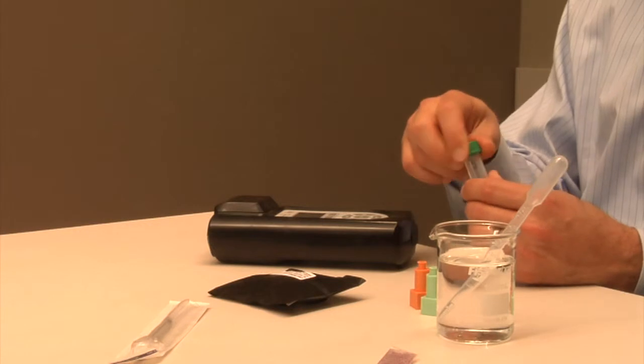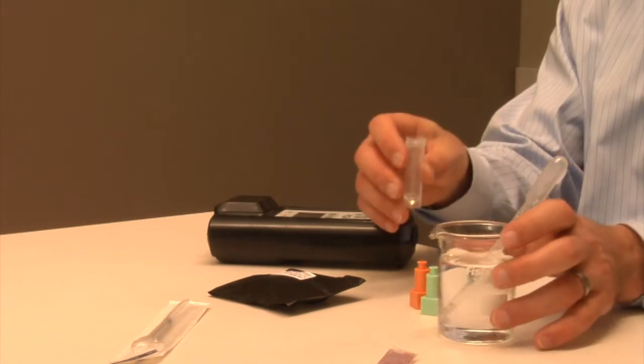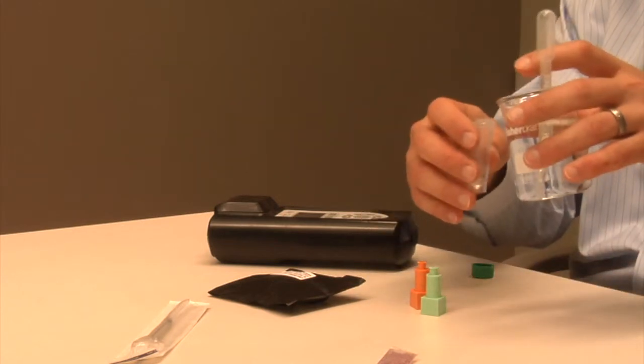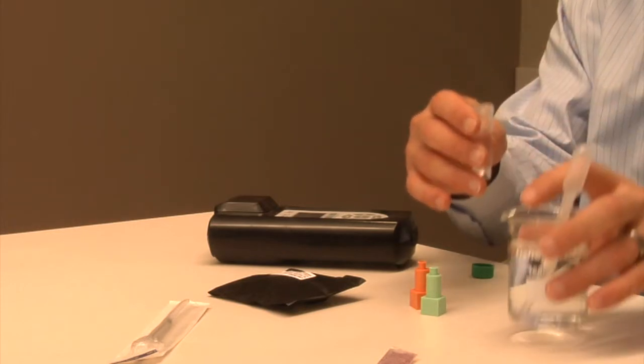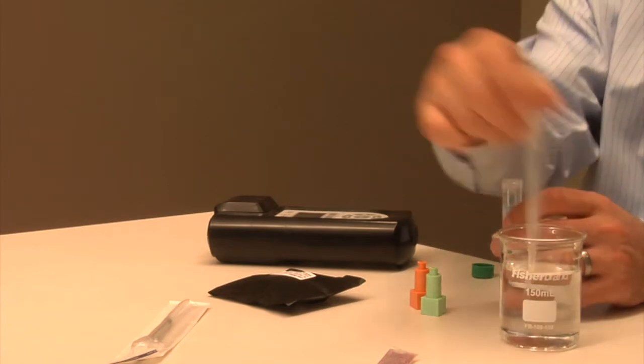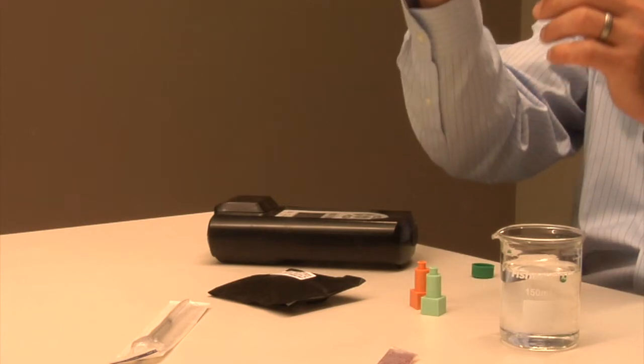Slowly pour the test water into the provided sample tube containing liquid buffer, up to the 5 milliliter mark. If required, use the provided plastic dropper to transfer water accurately without exceeding the 5 milliliter volume mark. Close the cap tightly and mix well by shaking. Once the sample is mixed with ANDalyze sample buffer, test within 15 minutes.